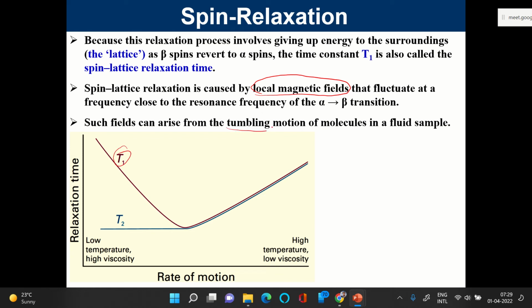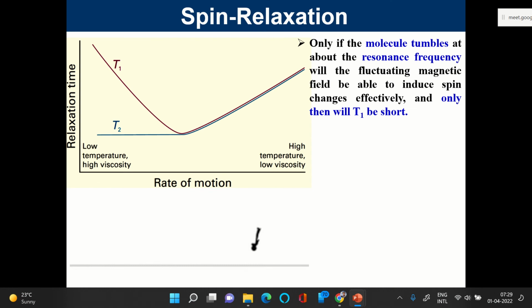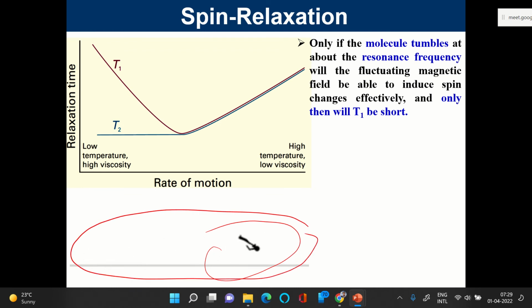So we are talking about tumbling. Tumbling means a molecule rolling over, just like a rolling ball from the top of a mountain. That is a tumbling motion, you can say. I have added another picture; the animation you see below is what we mean by tumbling of the molecule, tumbling of the solvent molecules. It is turning over and rotating randomly, so the direction keeps changing. So this is your tumbling motion, the picture that should emerge when you are talking about tumbling.